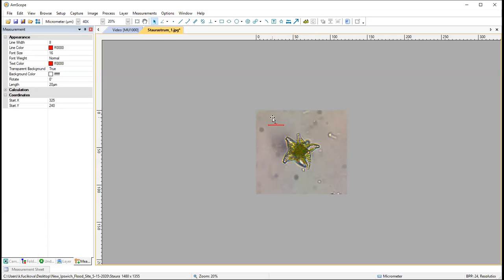But if you click on this object select, then you can move it. Otherwise you would have to set the coordinates here, which is, again, really annoying. The other thing that is a little unfortunate is the default color. There's a way to change the default, but it doesn't save the defaults from session to session. You can, however, click on it and change it to black.